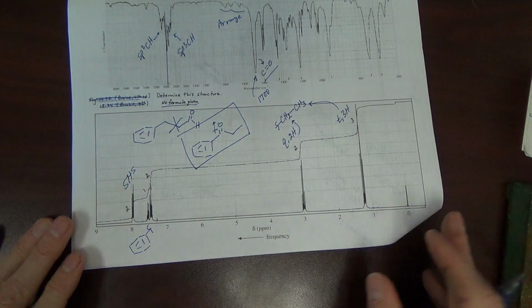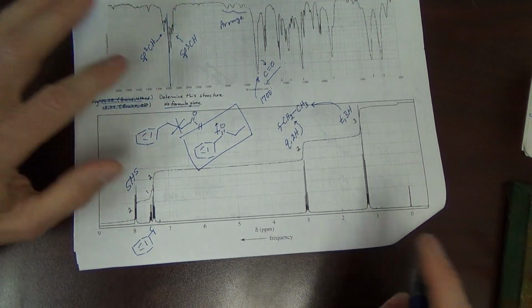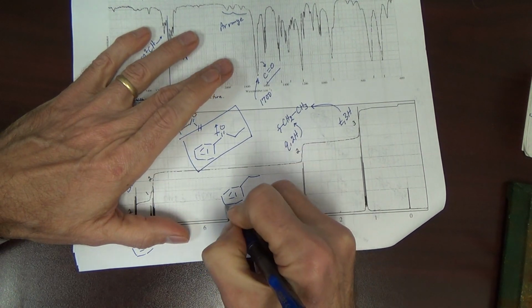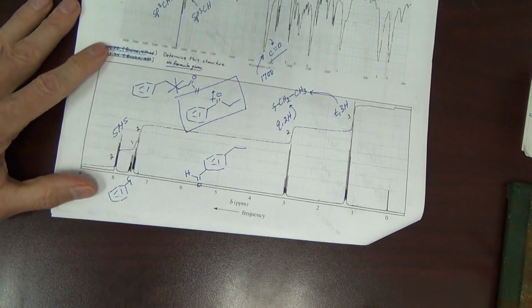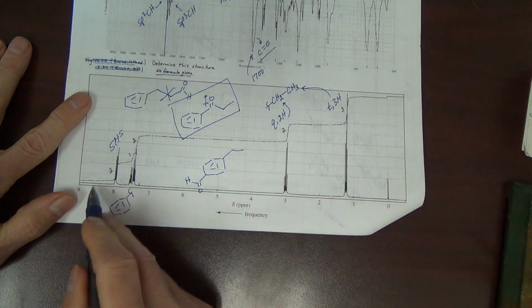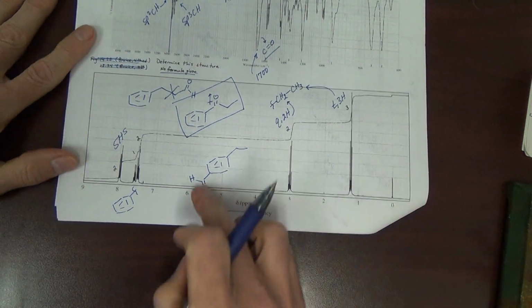Before we move on, students often give a number of incorrect structures. For example, let's just look at one. We might get this. This is a possible structure. The student says, I see an ethyl, I see a ring, and I see a carbonyl, and that's really the gist of it, and puts this together.